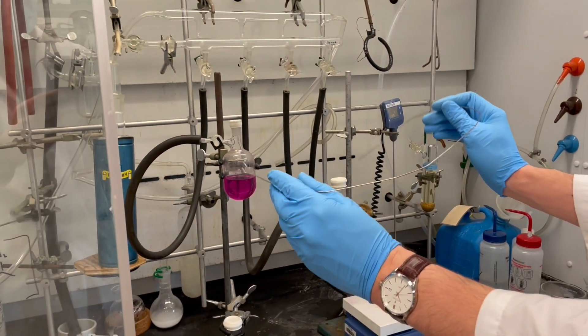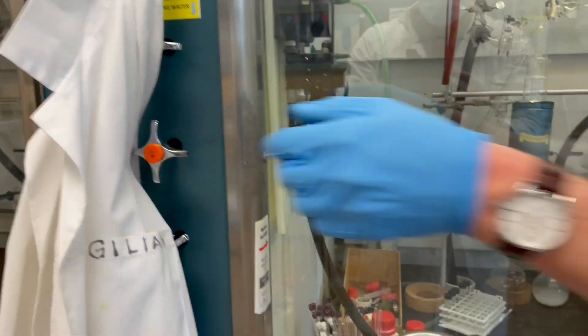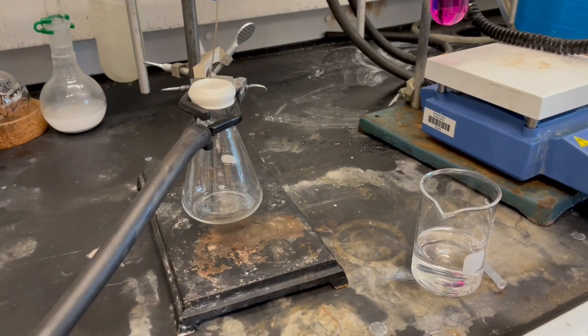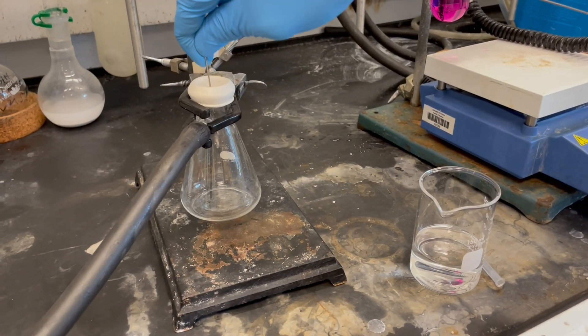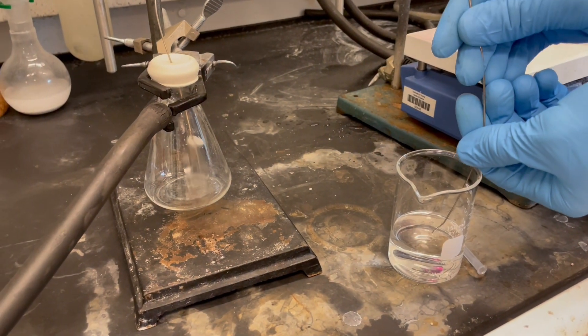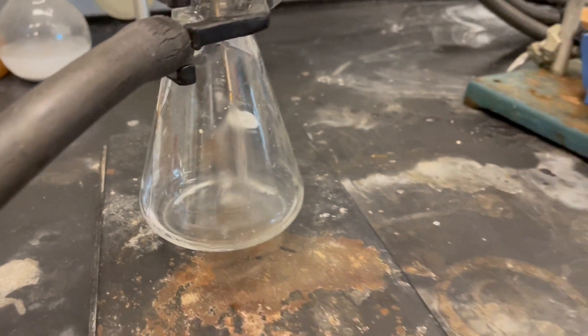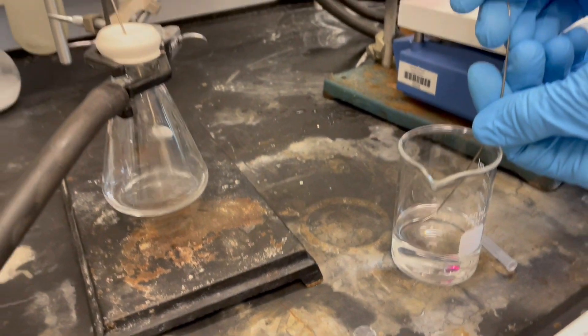Now we need to clean the inside. We can take a beaker of acetone, and with a flask under vacuum, insert the needle. Insert one end into the acetone and give it a couple seconds to clean out the inside of the cannula.